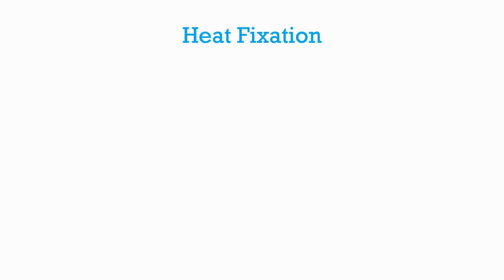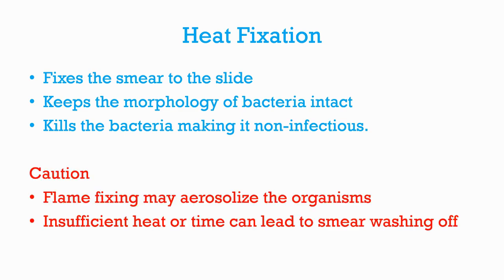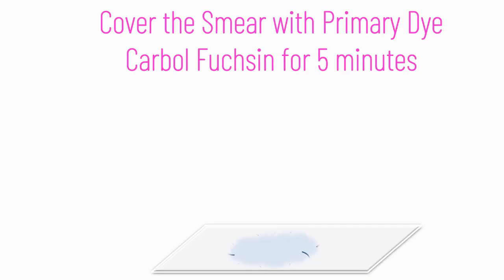Heat fixation fixes the smear to the slide. It keeps the morphology of the bacteria intact. It also kills the bacteria, thus making the slide non-infectious. However, there are some cautions to be kept in mind. Flame fixing may aerosolize the organisms from the smear. Insufficient heat or time can lead to the smear washing off. The bacteria in the dried and fixed smear look colorless and indistinguishable from each other.